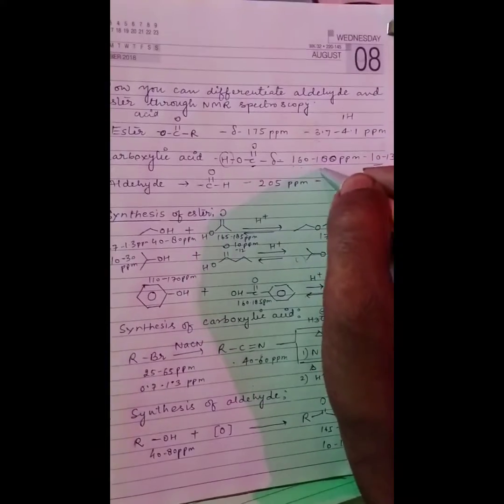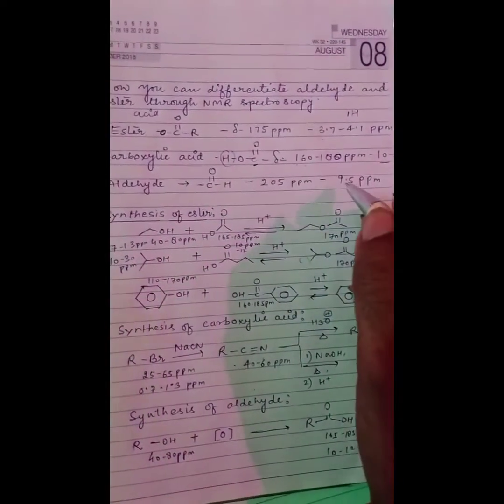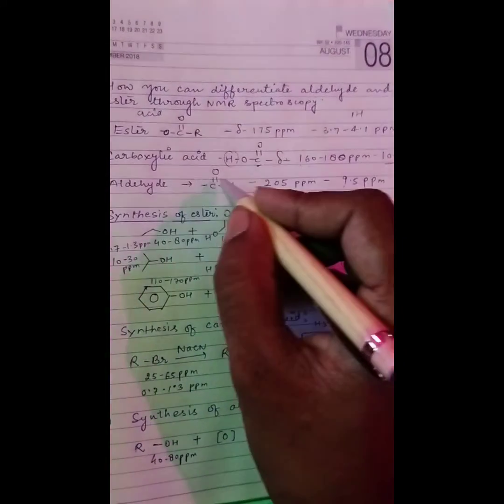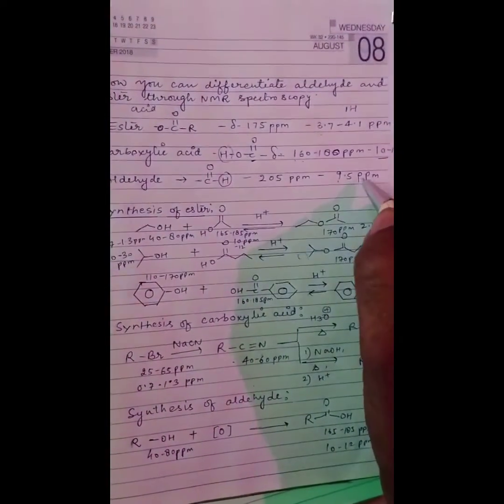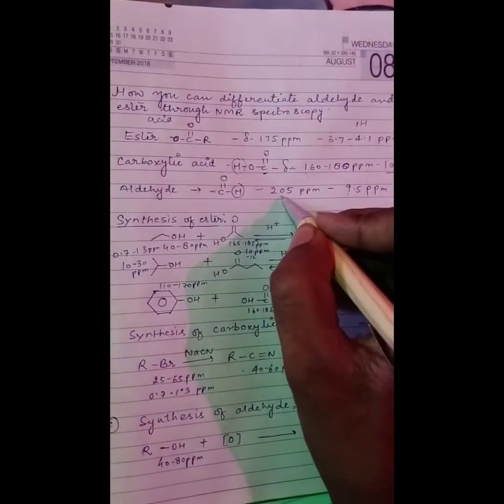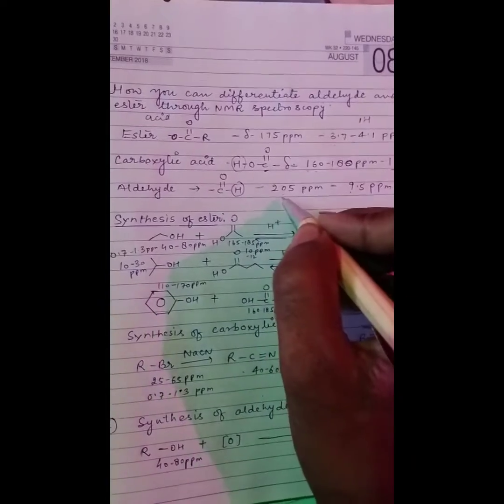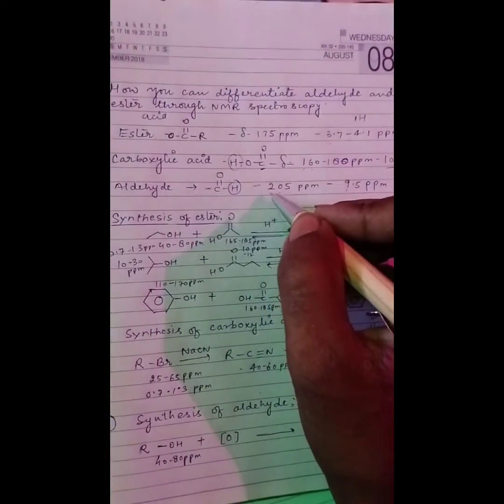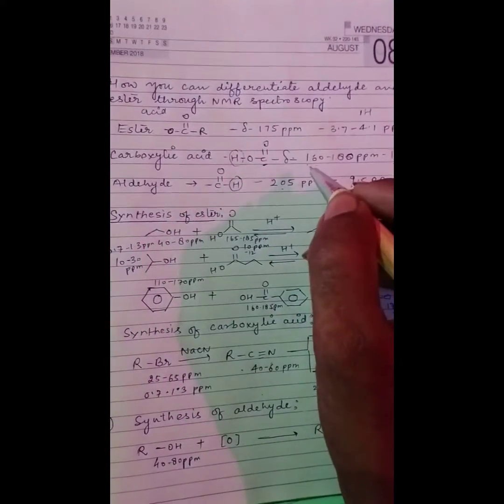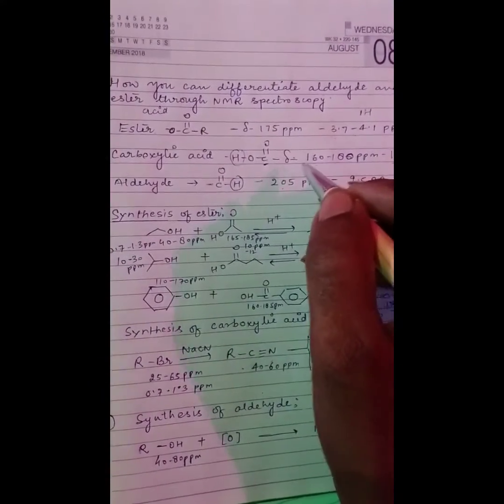After that, the aldehyde is the most characteristic compound. Its proton in the NMR spectrum will appear at 9.5 ppm, while the carbonyl peak appears at 205 ppm. So these three compounds differ from each other, and by this you can differentiate ester, carboxylic acid and aldehyde.